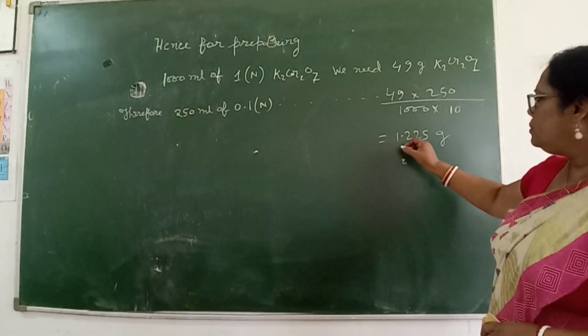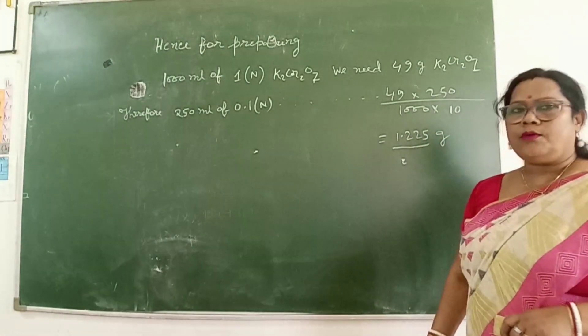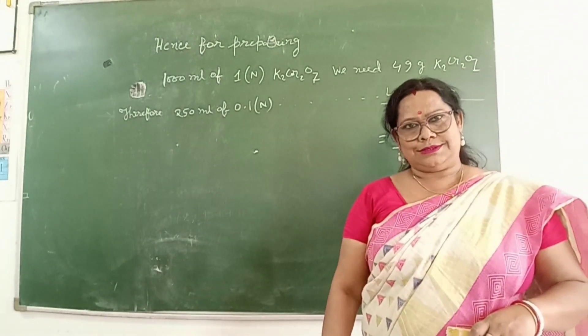So, we weigh out 1.225 gram of potassium dichromate crystals. Thank you.